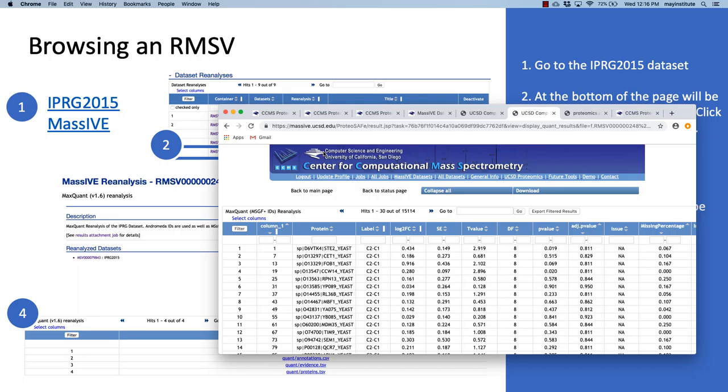Yeah. So when you upload files, you can upload FASTA files, raw files, spectrum files, and then configure your searches using any files you like. Okay. You can, as long as the database is a FASTA file. And then, you know, it's your own transcriptome file that was translated and used to generate sequences. So yeah, absolutely. That's always an option.